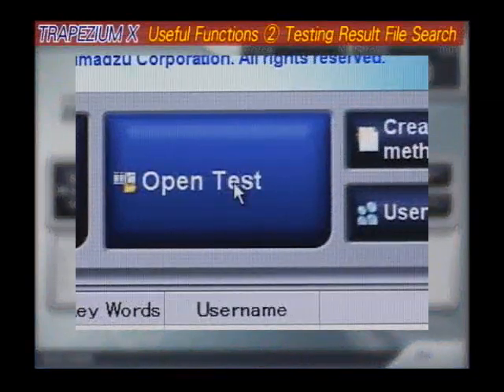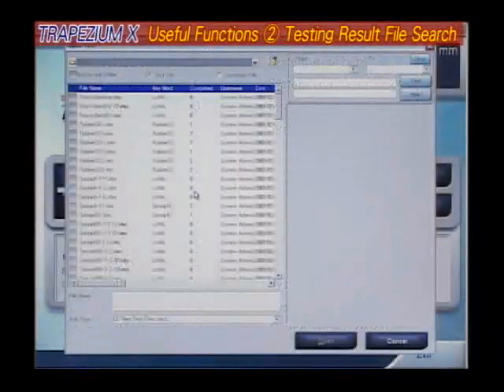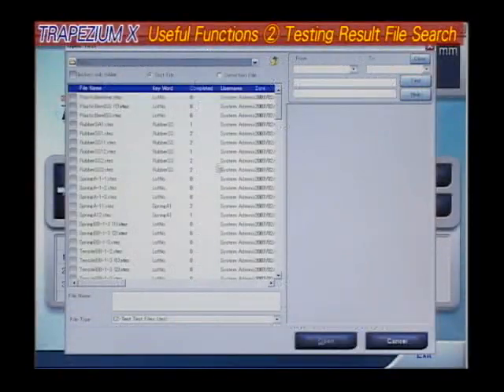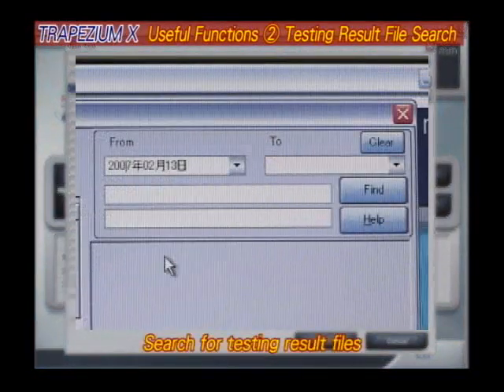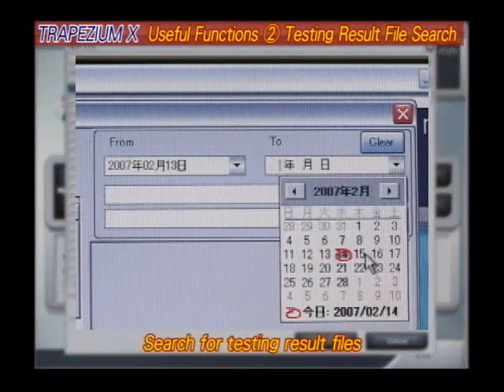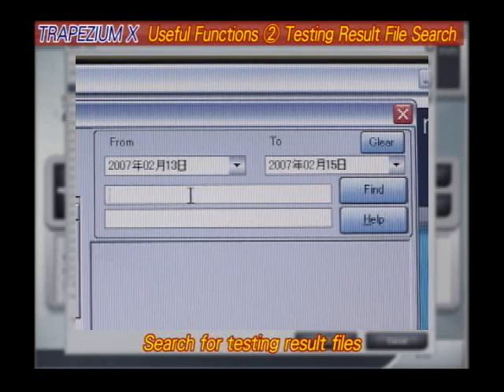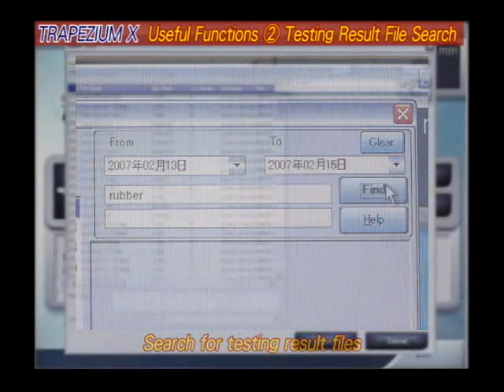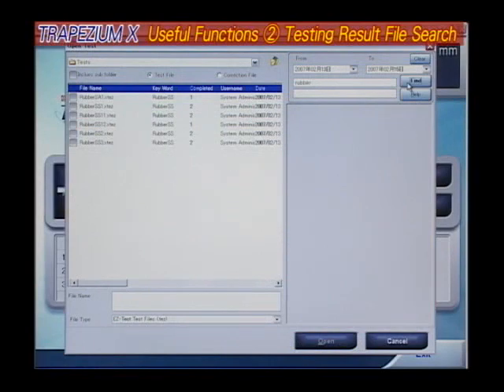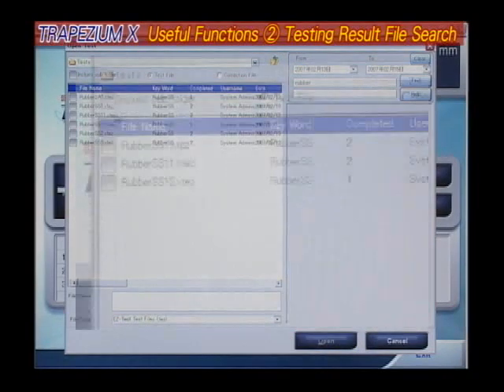File Search for Test Results. Use this function's easy-to-view format to search for and quickly recall results from past tests. All results data recalled can be printed as well.